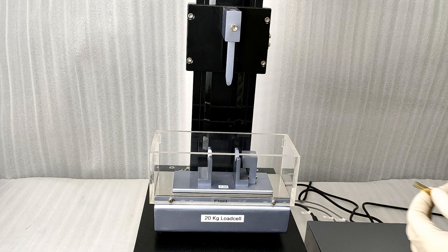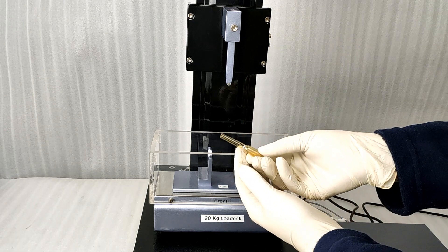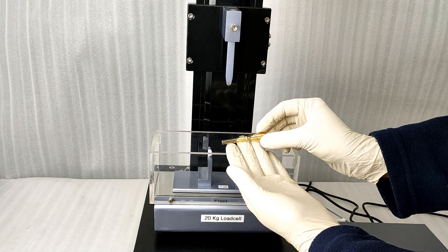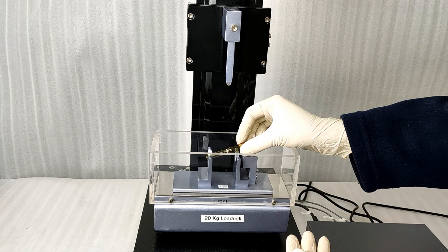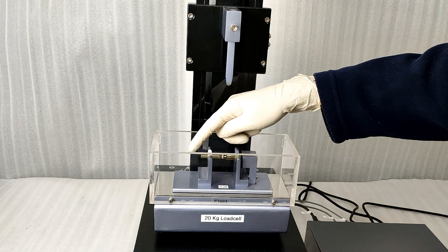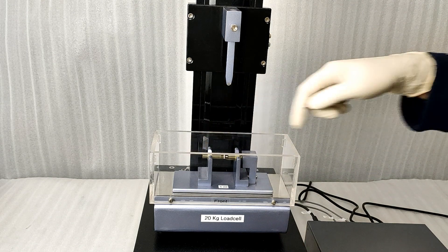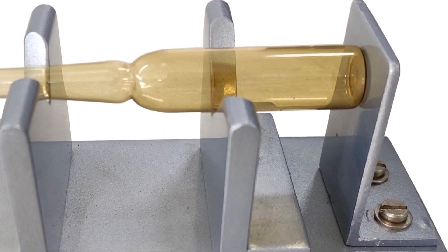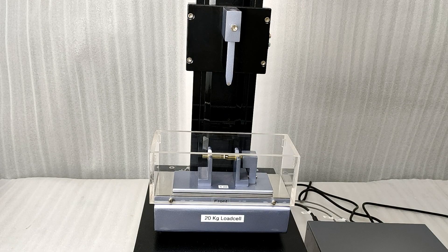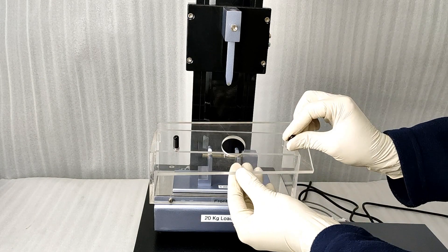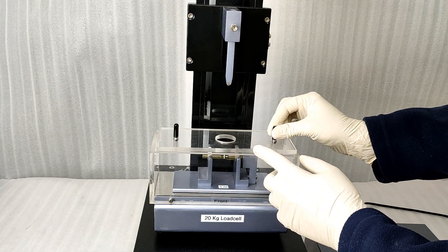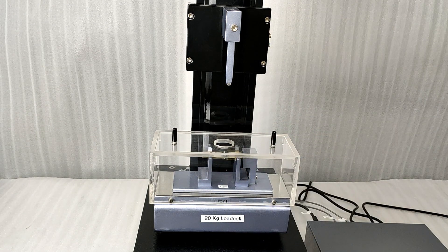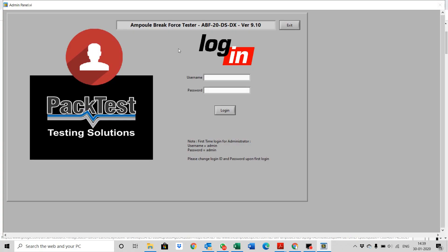Now place the ampoule in the holder and push it slightly towards the base. The stopper plate will ensure proper centering of the sample. Place the top cover as shown. This will prevent the glass splinters from coming out.